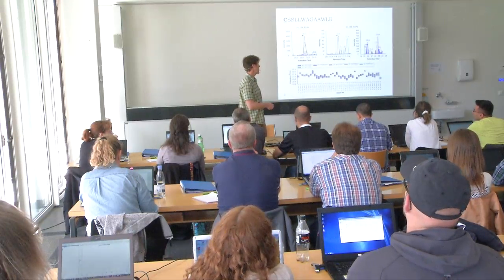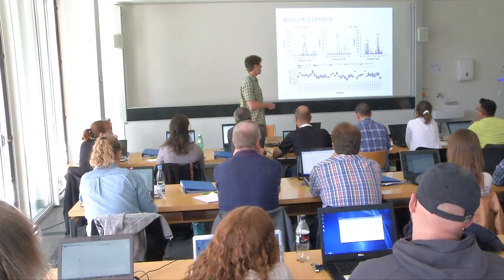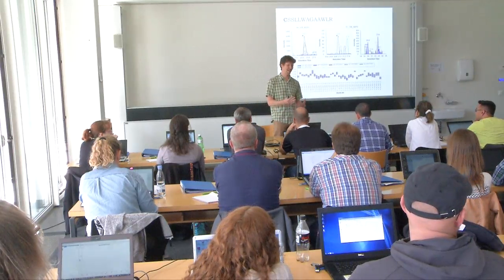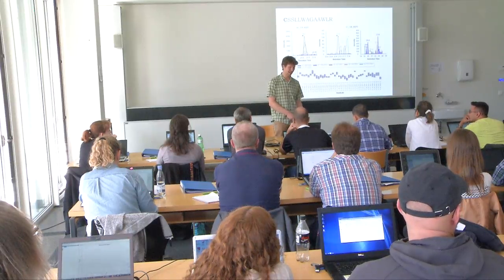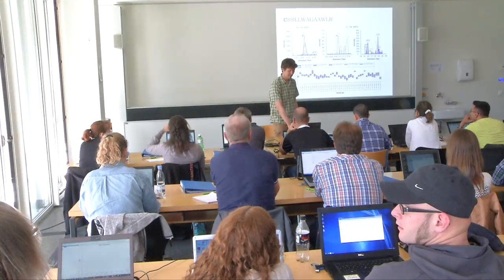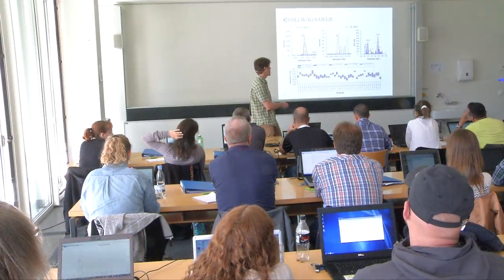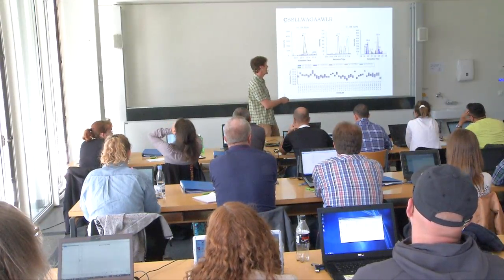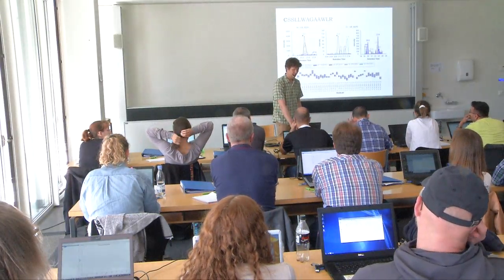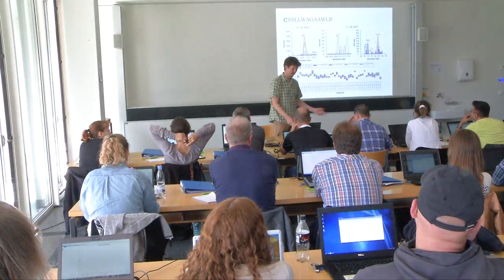If these were measured all disease then all healthy, then maybe I could believe that, and I might have to look at this more closely and figure out whether they were acquired at different times and maybe with different chromatography. But at this point, seeing this acquisition order, I feel pretty confident that there should be something to measure in this area for this peptide every time.